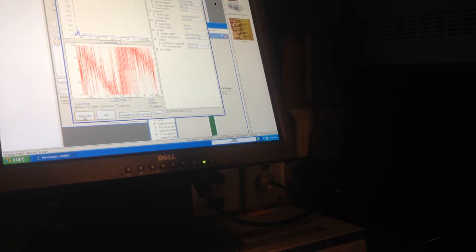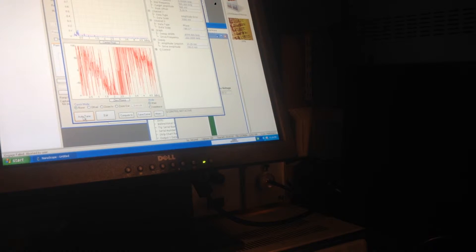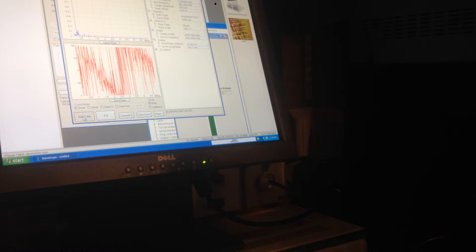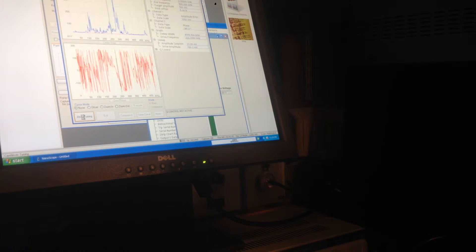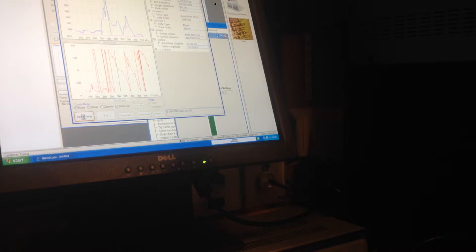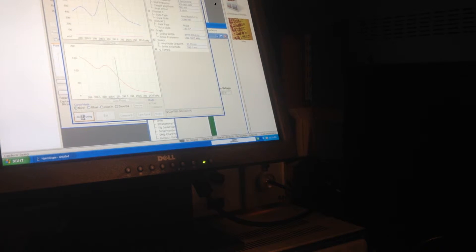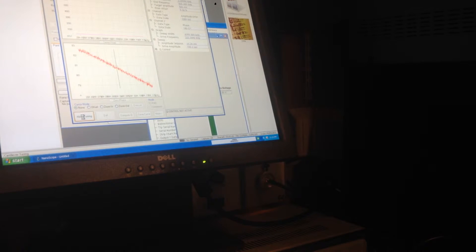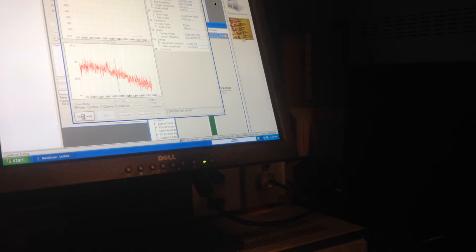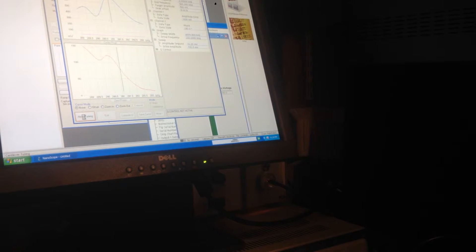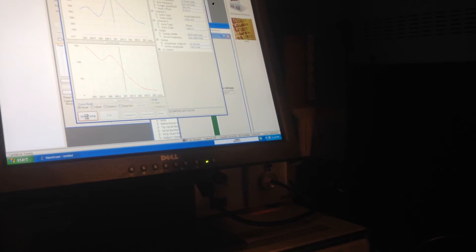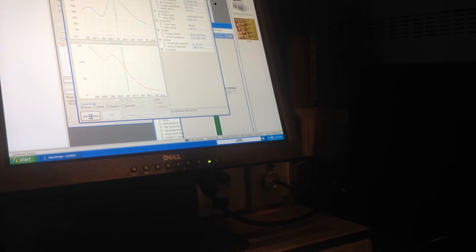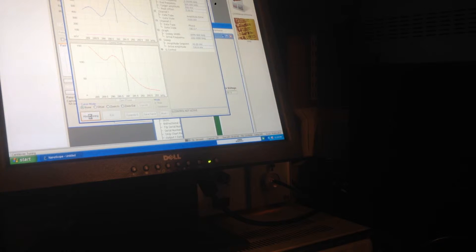I have another video on this. You hit auto tune. Maybe I screwed this up, but basically auto tune should complete successfully and not give an error. If it gives an error, you screwed something up.